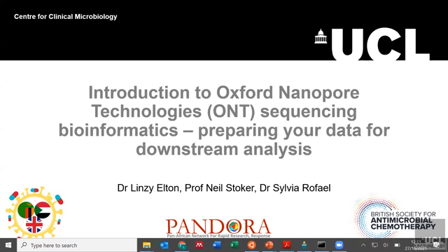As I say, hopefully there's much more information in the PDF that I sent around and that I will put on the Global Health Network pages, and I'll send that link. There's quite a lot to go through, but as I say, please feel free to shout out and ask questions. So, okay, why is this not working?